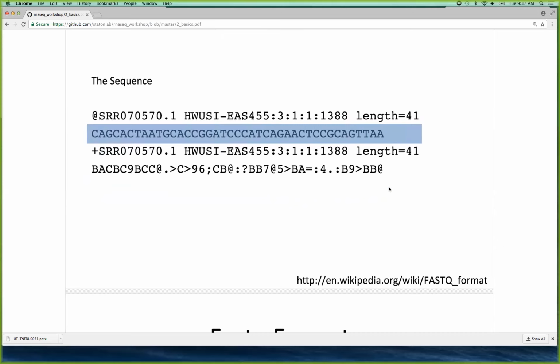When Illumina first came out, the maximum read length they could do was 25. So if you get old data, well, and some people still sequence relatively short libraries. I know people who do RNA-seq at 50 or 75 bases. 41 is particularly short. I don't think anyone sells 41 anymore, but I do see 50s still. When they first came out, I was like, what are we going to do with 25 bases? It's terrible. So in the scheme of things, they've actually added a lot of length over the past 10 years.